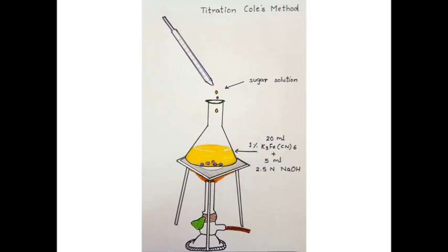So now the solution has a blue color. Now continue the titration until the blue color of the methylene blue disappears. Now note down the volume of the sugar solution consumed, and this is our pilot reading.